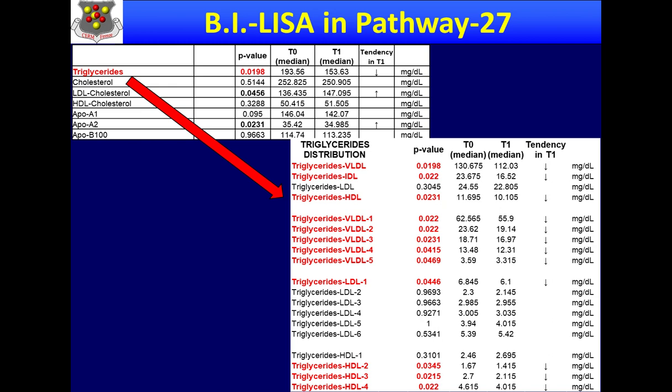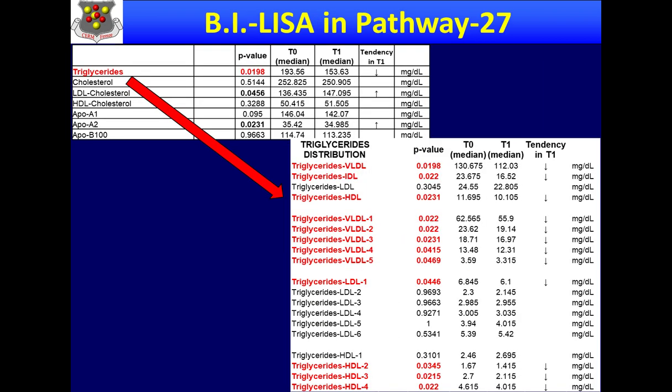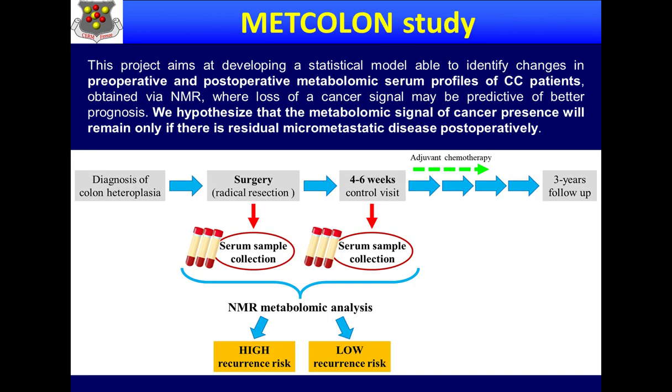And that seemed to be a very clear way of discriminating these groups. So the discrimination, I should have said before, is before starting the diet and after the diet. So this was a diet which was the same for everyone. So as I said, this is a side result of the project that was aimed at identifying risk factors in people at risk of poverty.